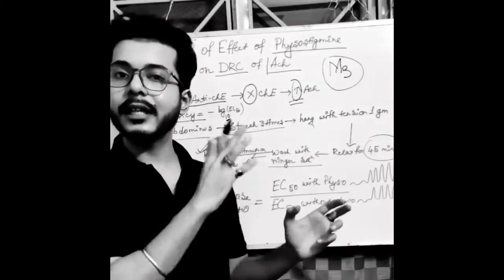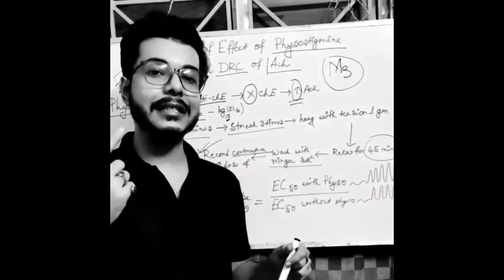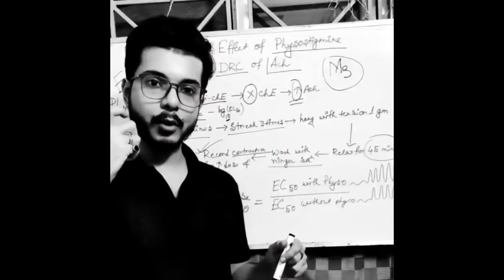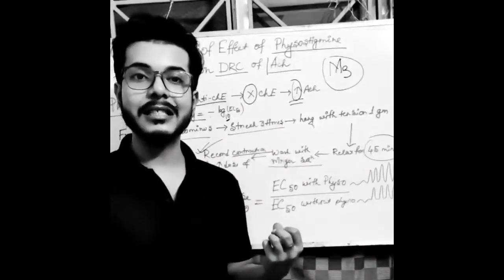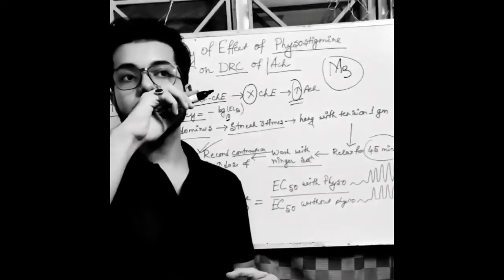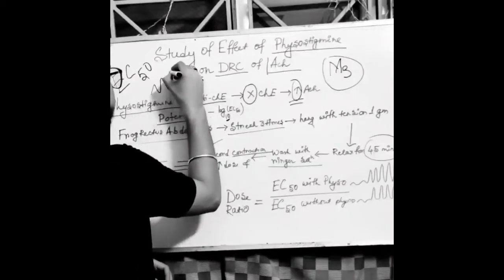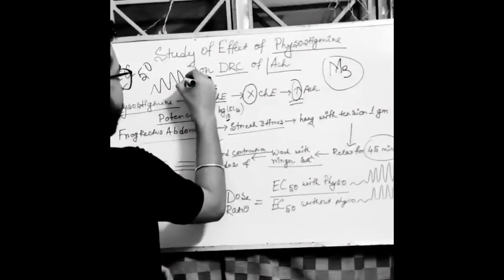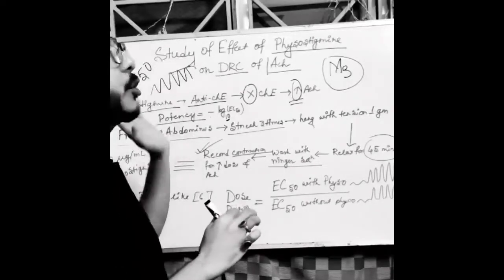So now you have to give the dose of acetylcholine. You have to incorporate that in the frog's Ringer lactate solution where the tissue is dipped, until you see a saturated position, like the graph is like this. At some point you will see the graph is the same, the heights are the same, so that is the final point. So now you have to stop.